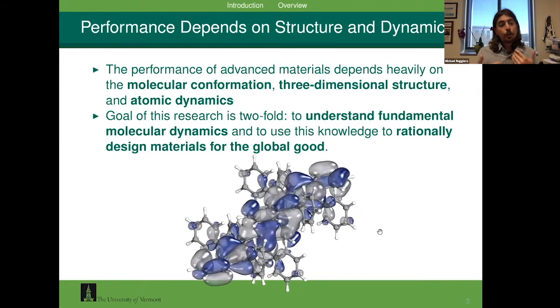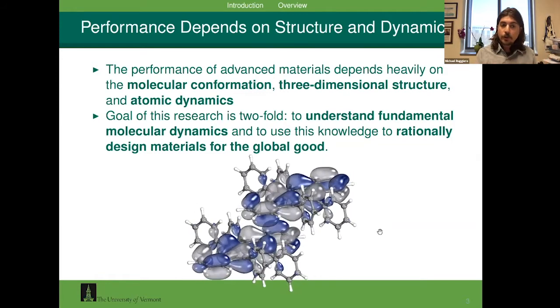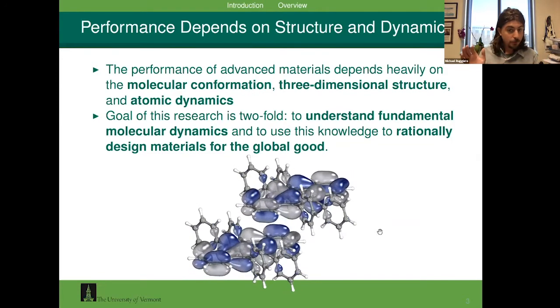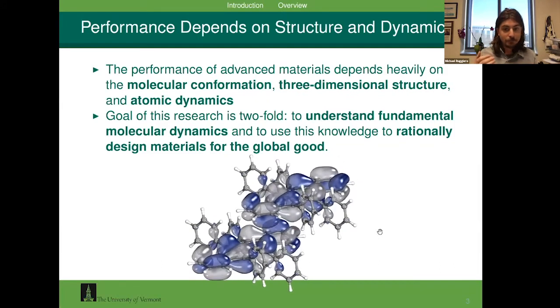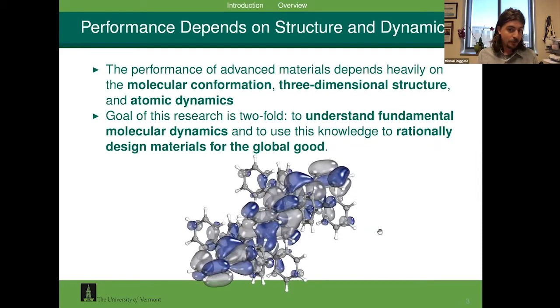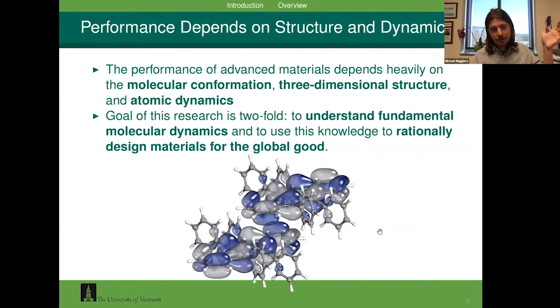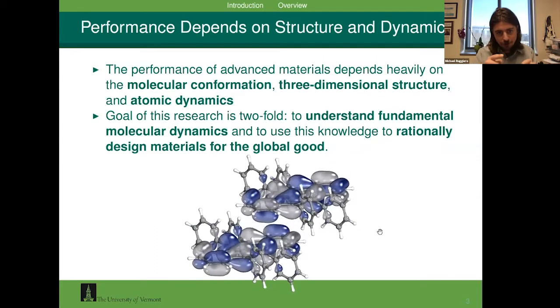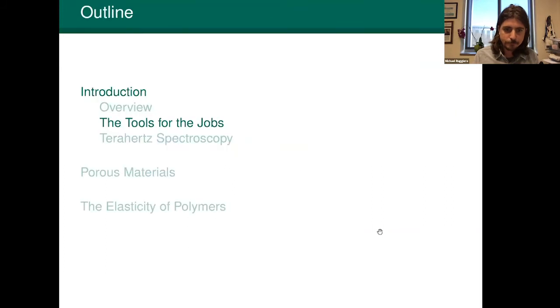And this is what I mean, that we're not limited by the type of material. We can find out this information for a pharmaceutical molecule. We can find it out for plastics. We can find it out for semiconductors. I joke that we'll stick anything in the beam. We'll throw anything in our laser beam and try to understand what's happening. Once you know the fundamental forces, all you need to know is what problem you need to figure out, and then figure out how those two are interlinked. That's the theme of everything that I'm going to present today.